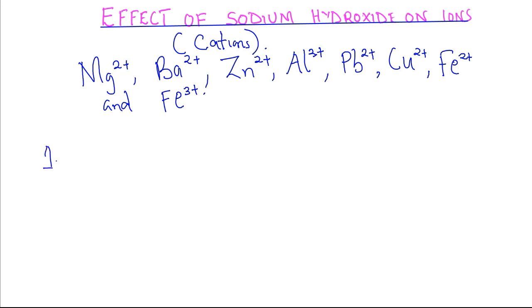Let us start by looking at addition of sodium hydroxide solution on magnesium ion.